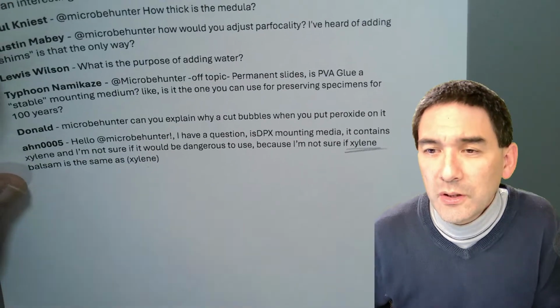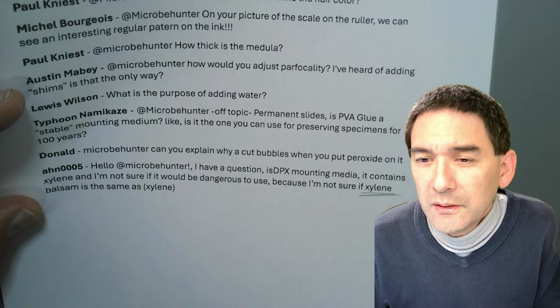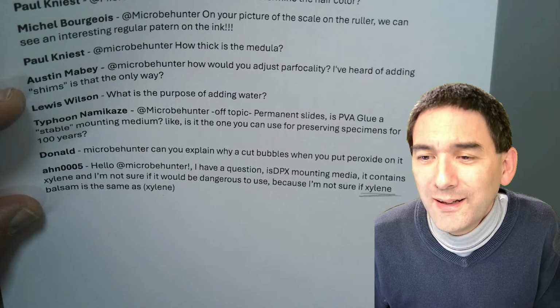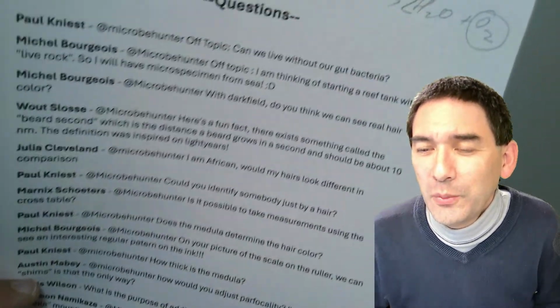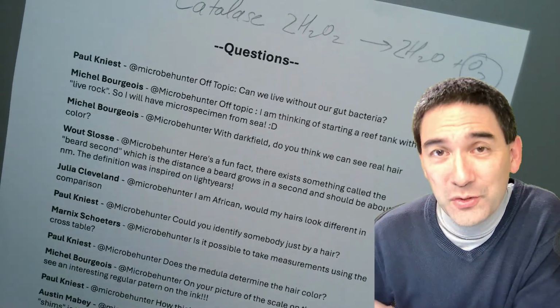Yeah? So what I'm going to do now is I'm going to quickly look at some of the, how do you say? Let's go back together in 21, 24 to examine those. Yeah. I just want to say the following.